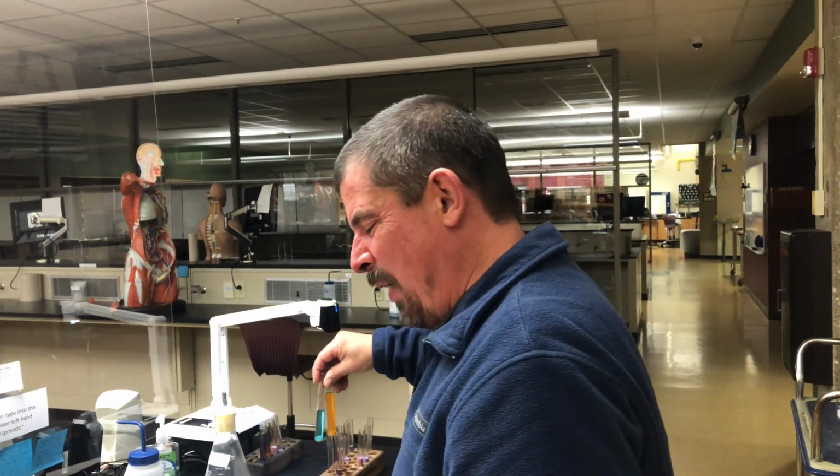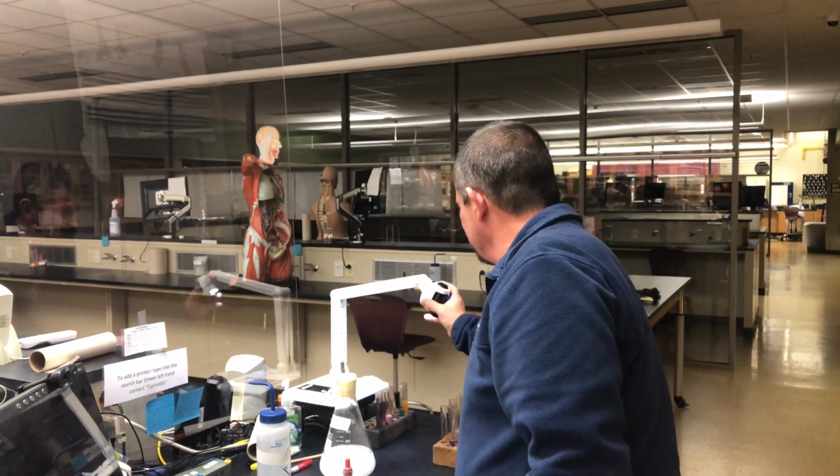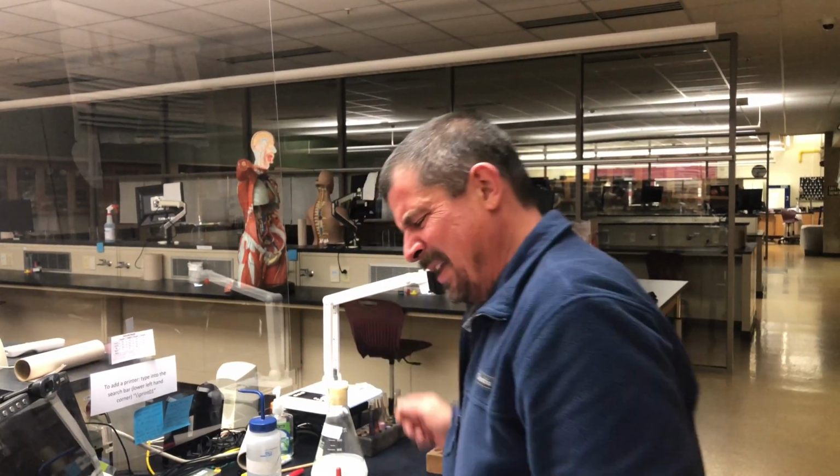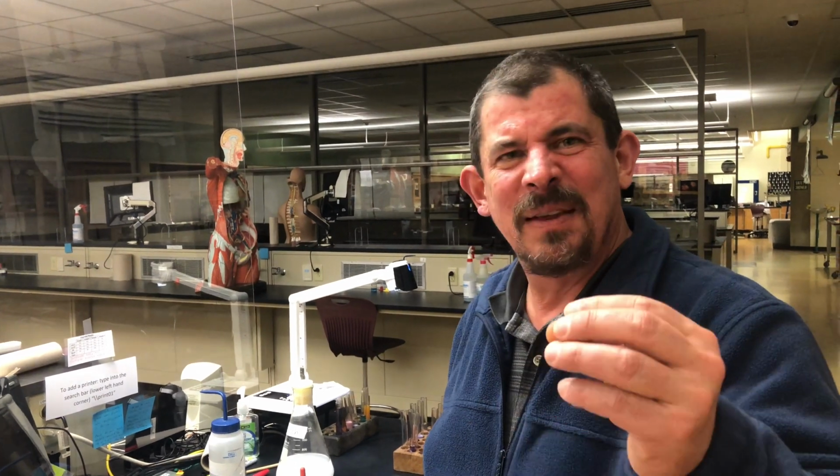Okay, so now as we come down, what was the color change seen in the sample from tube 5? Again, tube 5 is the tube that we added the pancreatin to. So you would see some color change. It would go from blue to a significant red, green, orange, or yellow. And then what is the color change seen in tube 6? There is no color change.